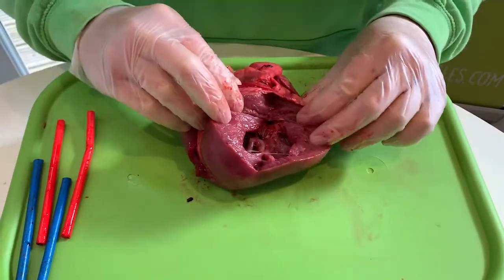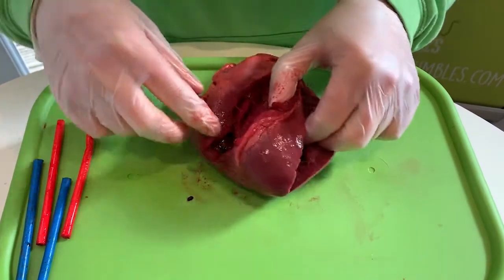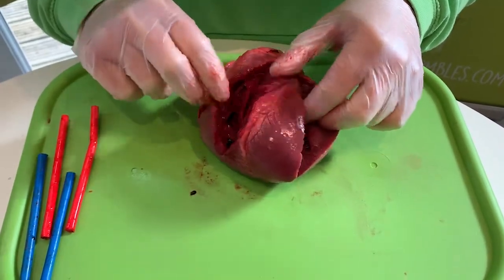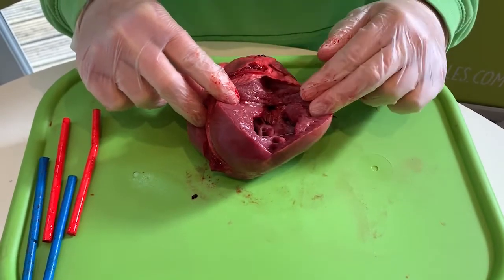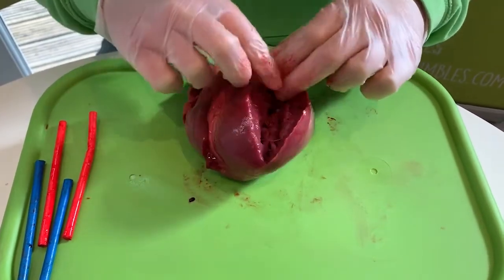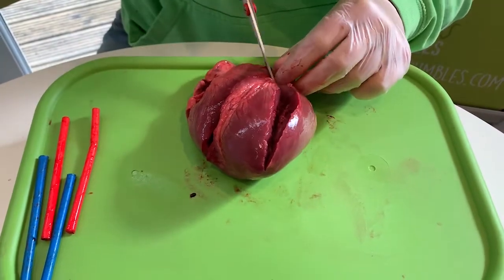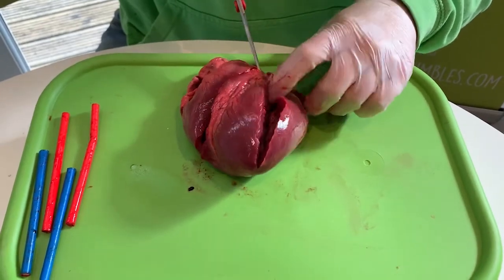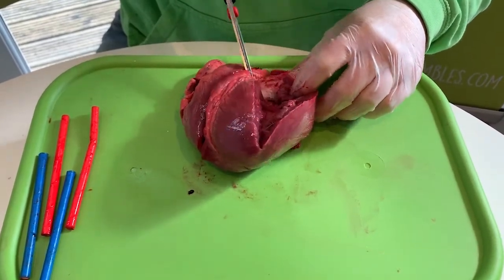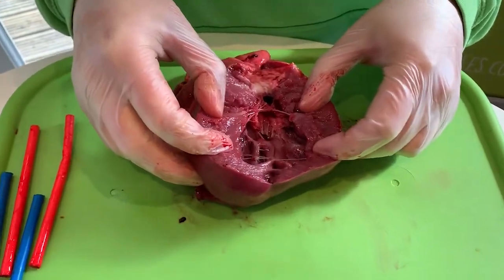Okay, so you can see how massively thick the walls of the left side of the heart are compared to the right side, okay? They're really thick, and we know that's because the left side of the heart has to send the blood everywhere in the body, okay? I'm just going to completely cut this open. Okay. So have a look in there.